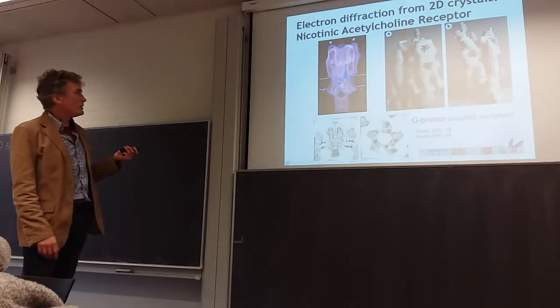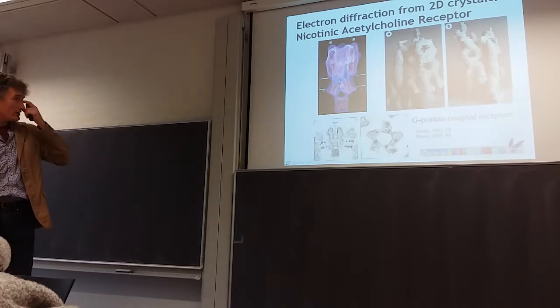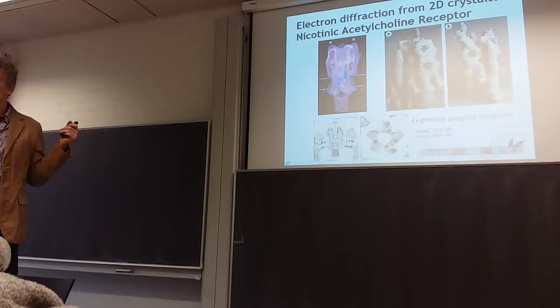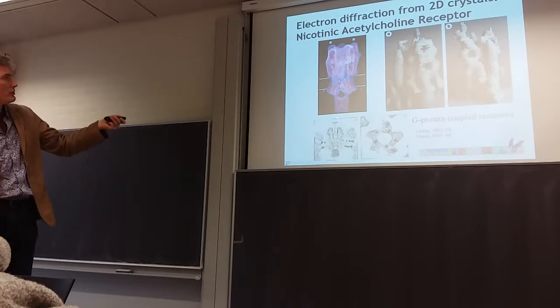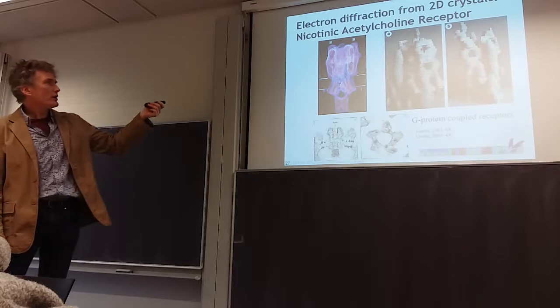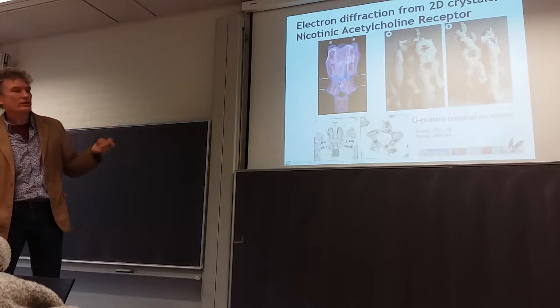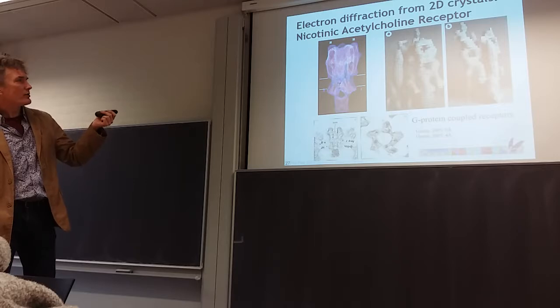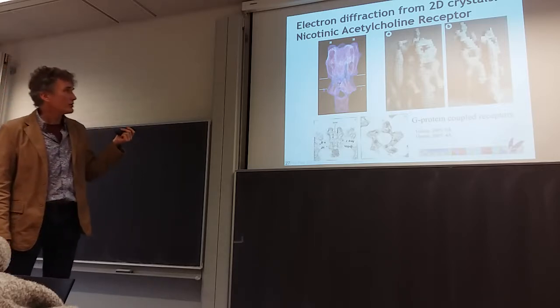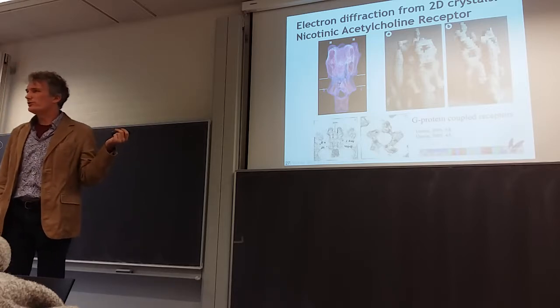Okay, so this is one of the early success stories. I think it's the first human membrane protein whose structure was solved, and this is a view of the electron density map. This is a different way of visualizing that. This was actually already quite old-fashioned in the late 1990s, but it's just cut slabs of, I think, wood, could be styrofoam, but I think it's wood. It's a lot of work anyway, so why not make it durable?